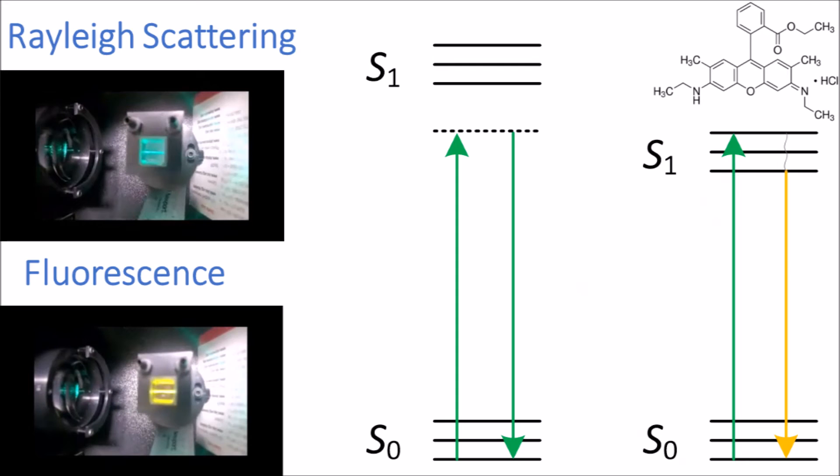Normally, we wouldn't use our eyes as detectors for fluorescence spectroscopy measurements. We would have a more sensitive detector, and we would have this at right angles to the sample so we don't blast it with laser light.